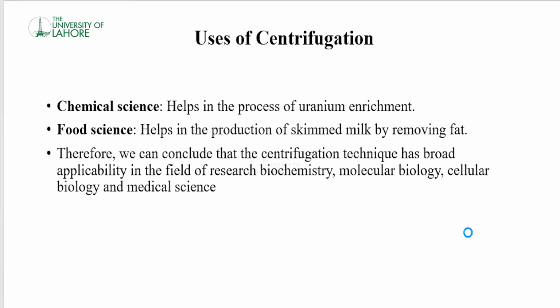Therefore, we conclude that centrifugation techniques have broad applicability in the fields of research, biochemistry, molecular biology, cellular biology, and medical sciences.